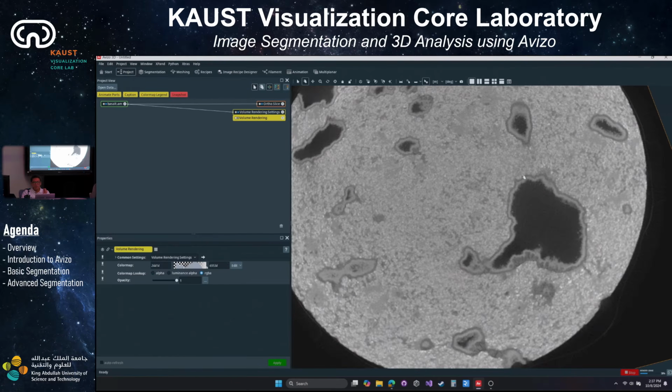And what happens is, because of this mineral, the amount of gas, the amount of void you have gets reduced, right? And for them, they want to measure that, okay? They want to measure how much the mineral, basically the volume of the mineral, right? Because the volume of this mineral is the amount of gas that they're not able to store in the rock anymore because of the mineral. Does that make sense?